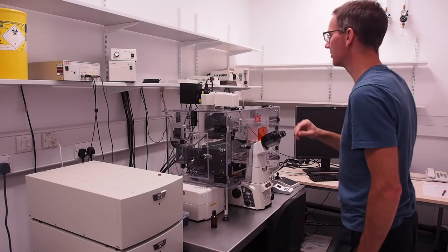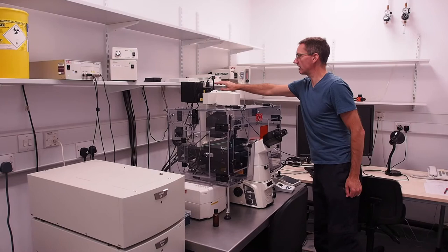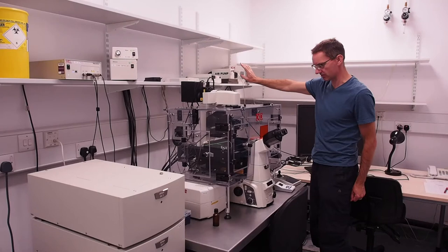On the same shelf switch on the power for the camera if you're using the system in wide field mode. To the right of this are the controller units for running the incubator, we won't be using these.